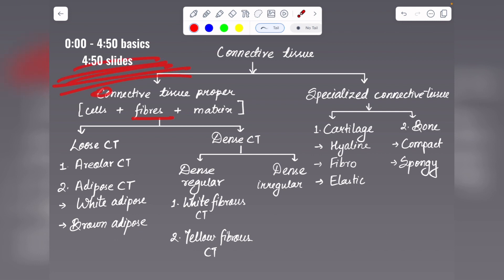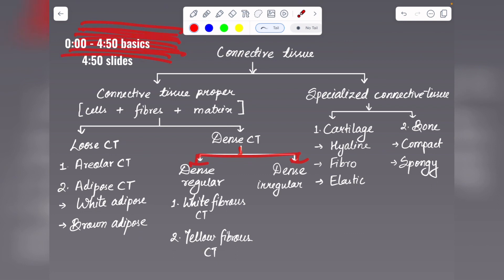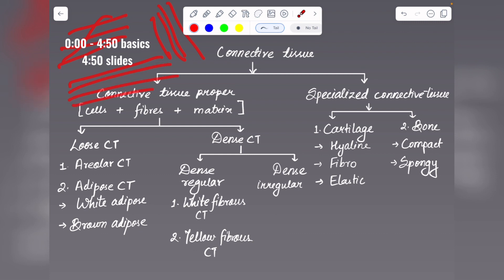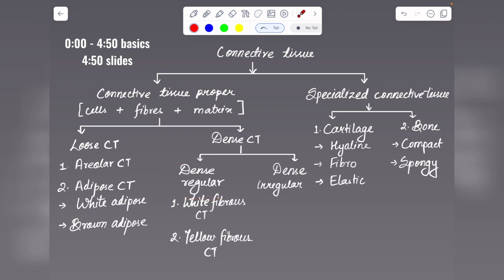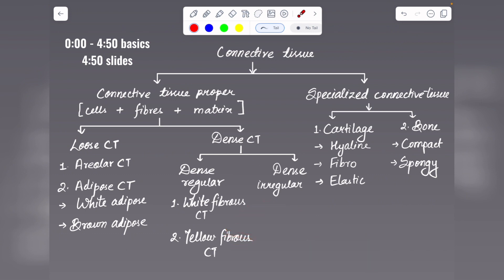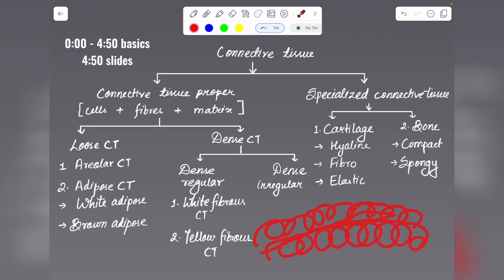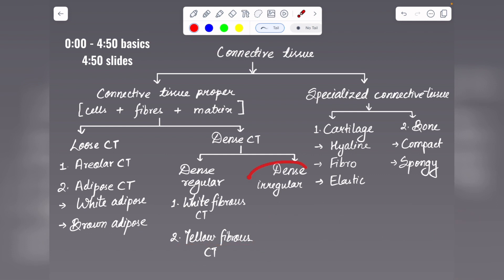In dense connective tissue, fibers are compactly arranged with cells in between. Depending on fiber arrangement, it is of two types: dense regular connective tissue, where fibers are arranged in a particular direction, and dense irregular connective tissue, where fibers are randomly arranged. Under dense regular connective tissue, white fibrous connective tissue contains unbranched collagen fibers in bundles with cells in between. Yellow fibrous connective tissue contains branched fibers that appear highly coiled and wriggly under a microscope.